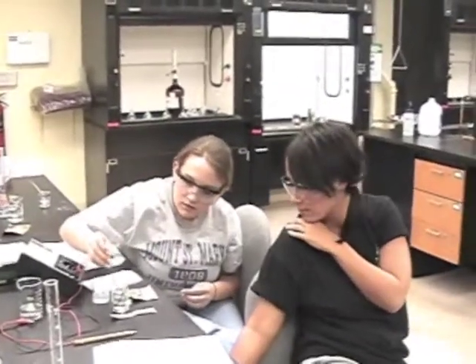So if the copper is being reduced, what's being oxidized? The lead. From what to what? From 0 to plus 2. So we have lead plus 2 forming, and there's sulfate ions in solution. So that could make lead sulfate. Would that be soluble or insoluble? You remember the solubility rules? Insoluble. So that's what the white stripes are: insoluble lead sulfate.